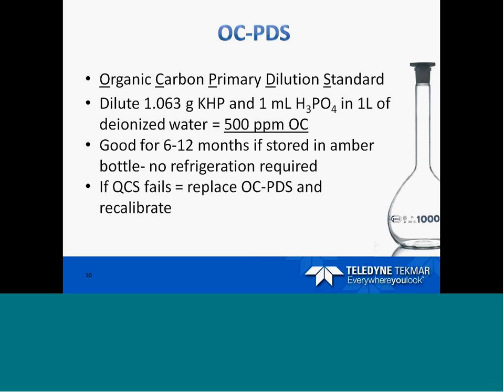We're going to go ahead and make our calibration curve from this. Now, later on, you run your quality control sample. If you remember, the quality control sample is a known standard with a known concentration that is just like all of your samples and usually purchased from an external source. If your quality control standard fails, that is one of the indicators that you may want to go back and recalibrate your system. Time for a new calibration.